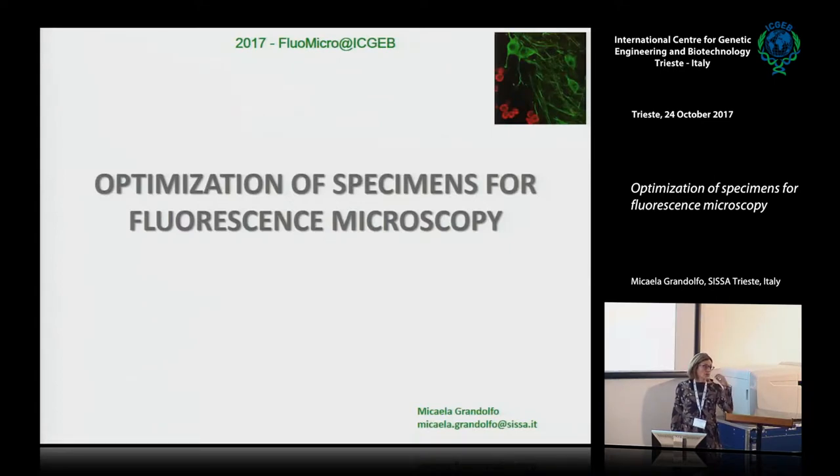Because, as you have already heard from the previous speakers, it is really difficult to find a good setup of your confocal microscope. It takes a lot of time to set perfectly the power of the laser, the gain, the offset, to choose the right fluorophore, and so on. So please, when you decide to go to the confocal microscope, do not waste your time, and please do not waste the time of the poor confocal specialist, okay?